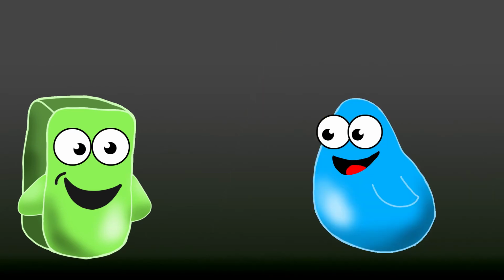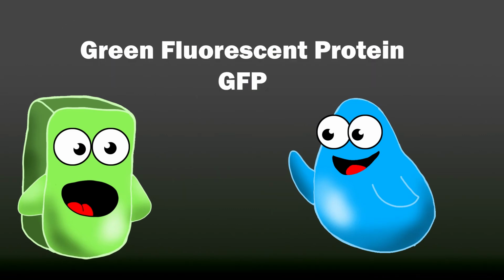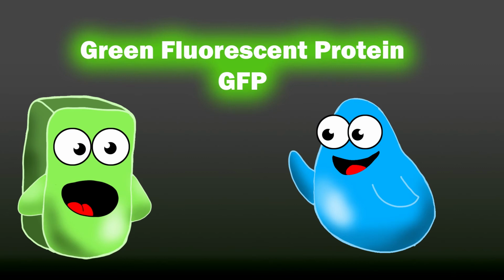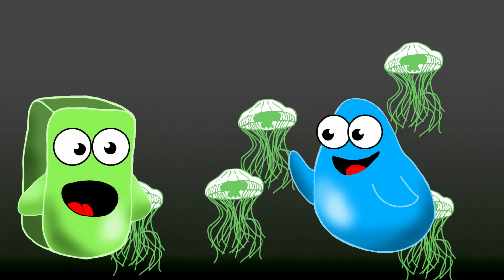Nope, not just with stains. Scientists can genetically alter cells or even organisms, so they produce a fluorescent protein. One of these proteins is called green fluorescent protein, or GFP. It actually originated from a jellyfish. Wow! What else do confocals do?